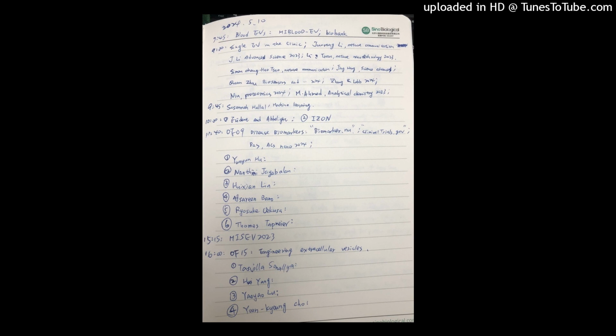But we can also characterize the 2 proteins in 2 separate samples, and we also collect 4 fluorescence parameters, but no matter how we optimize the perplexity of the t-SNE analysis, we could not distinguish the normal EVs from MCF7 derived EVs. So this underscores the clinical potential of dual protein analysis on single EVs for BCA subtyping.